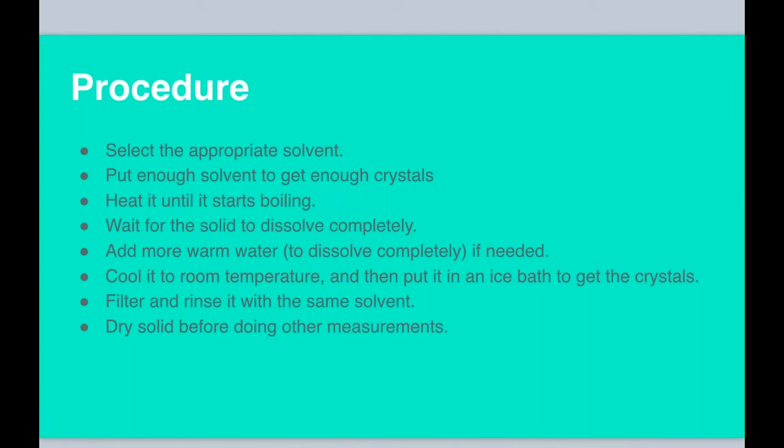As we all know, recrystallization is a powerful method to purify solids and crystals. Here's the procedure for recrystallization. The very first step is choosing an appropriate solvent. It could be one or more solvents, and it depends on the solubility of the given sample. It is important to put enough solvent to get enough crystals.